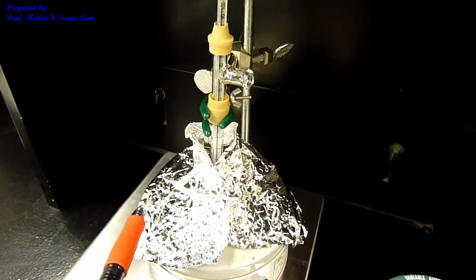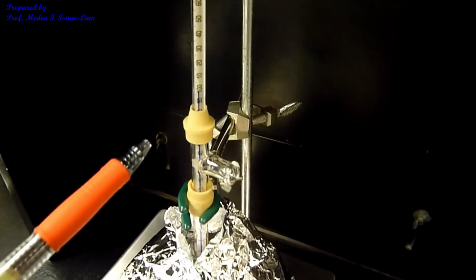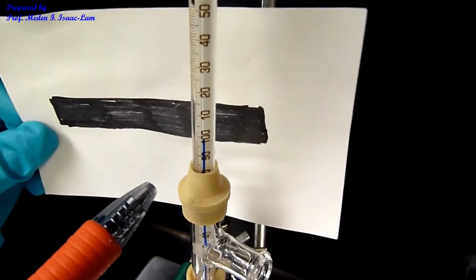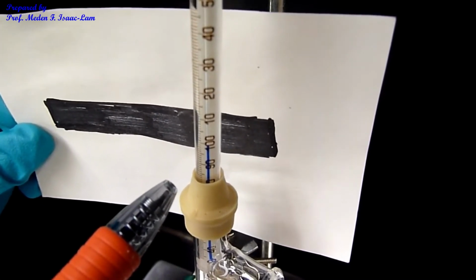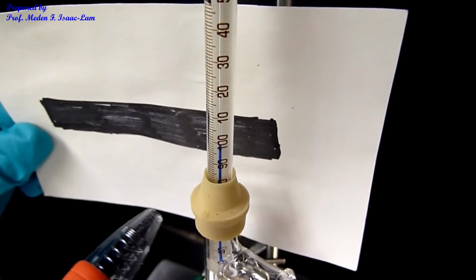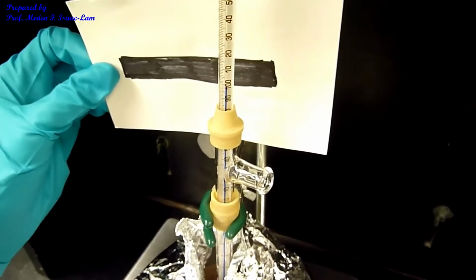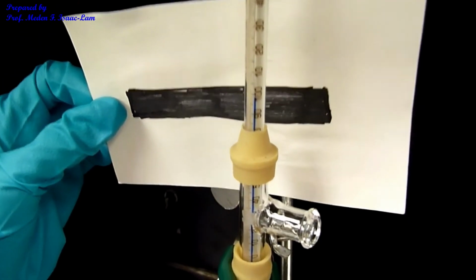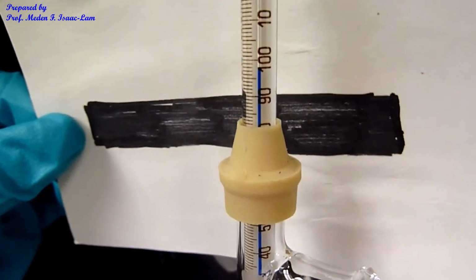So it took about 10 minutes, and now it's steady at about, the temperature right now is about 98. So it's steady for about 2 minutes. And then we're going to let it go for another 3 minutes. If it doesn't go up, that's going to be the boiling point of the sample. So after another 3 minutes, so it's like 5 minutes or so, the temperature did not go up. It's now 98. So the boiling point of the sample is about 98 degrees C.